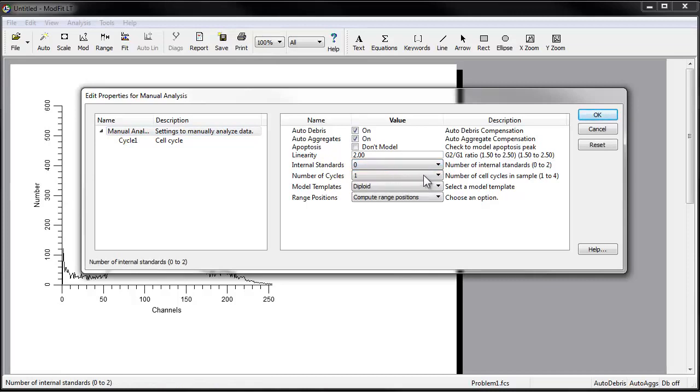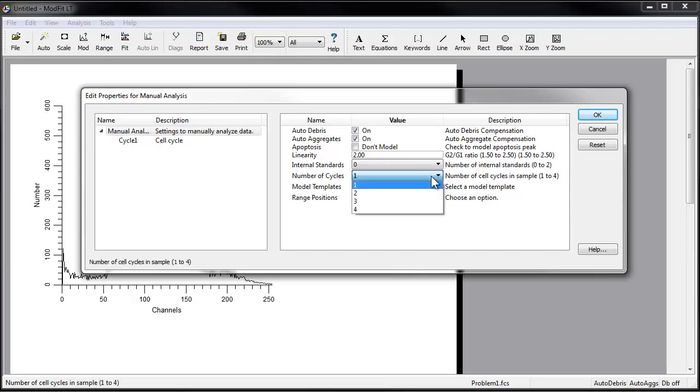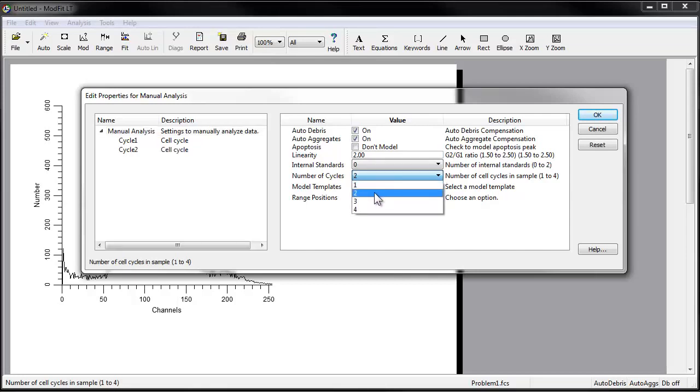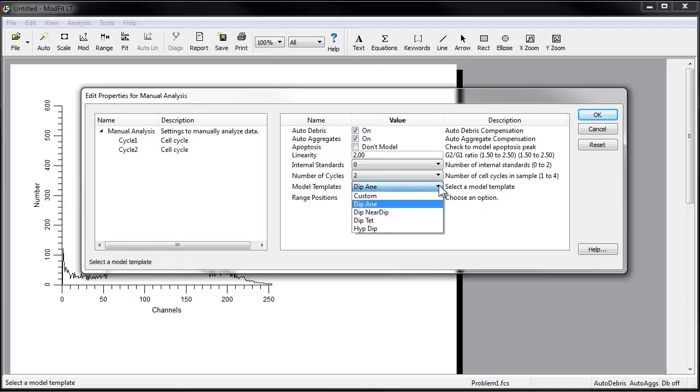We want to model two cell cycles in this data file, a diploid and an aneuploid cycle. Set number of cycles to 2. For the model template, choose diploid-anuploid. This tells the program the ploidy and the order to assign to each cycle.